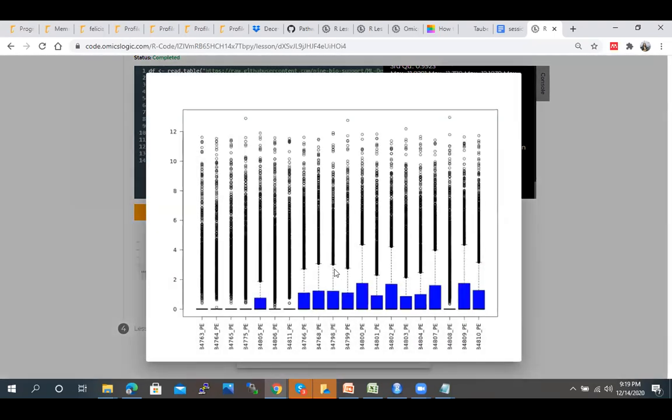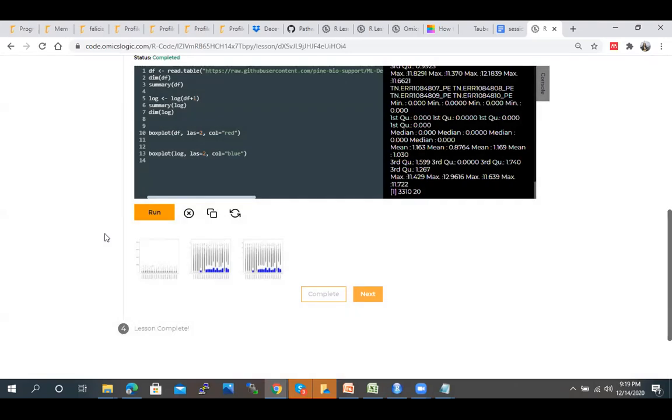So now if you look at this data, this is after the log scale transformation. Here you can see the minimum and the maximum value and how they vary. So we have obtained box plots for these particular samples. This clearly indicates the differences after performing the log scale transformation. Is it clear to you? How many of you were able to produce a box plot in R?